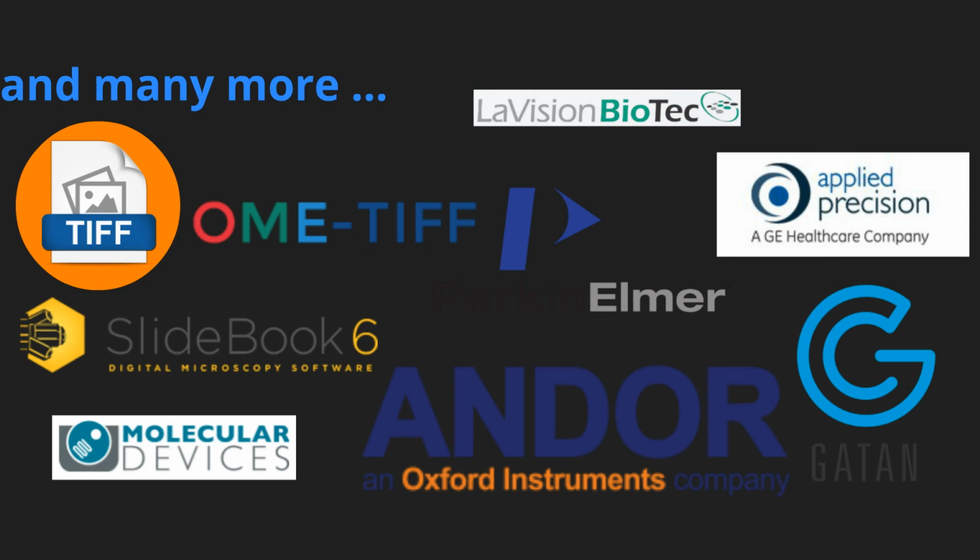They typically have little XML files with them, which we read. That is not the case for all XMLs. So if you're in a situation where you have a system that's generating TIFF files, come talk to me. We can always set up something where we can maybe have the software read your XML. So let me know about those situations. But for the most part, with TIFF files, if you don't have the metadata, it's going to be a little bit harder for you.